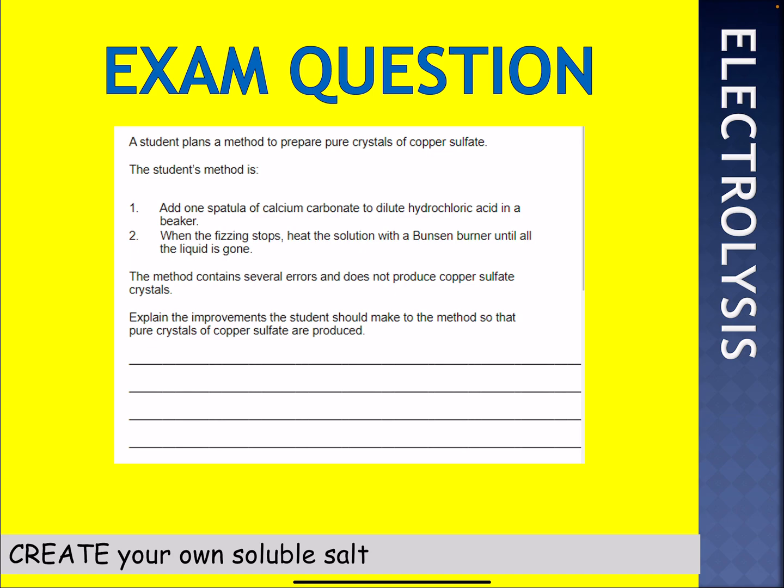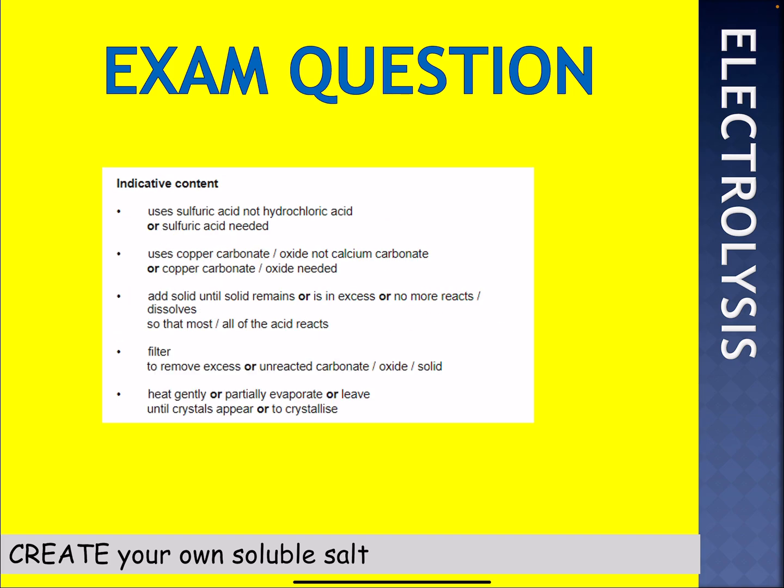Okay, let's have a look. That's the answers here. Use of sulfuric acid and not hydrochloric acid. The salt needed was copper sulfate, so the acid had to be sulfuric acid. Use copper carbonate and not calcium carbonate. The salt again was copper sulfate.